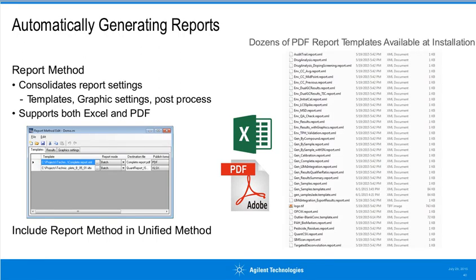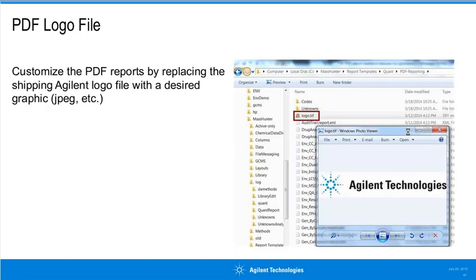And for those of you who are interested in exploring the PDF-based approach, there are dozens of templates that are available to you at the time of installation. And small edits to the PDF reports can be made, for example, changing a logo or a label.